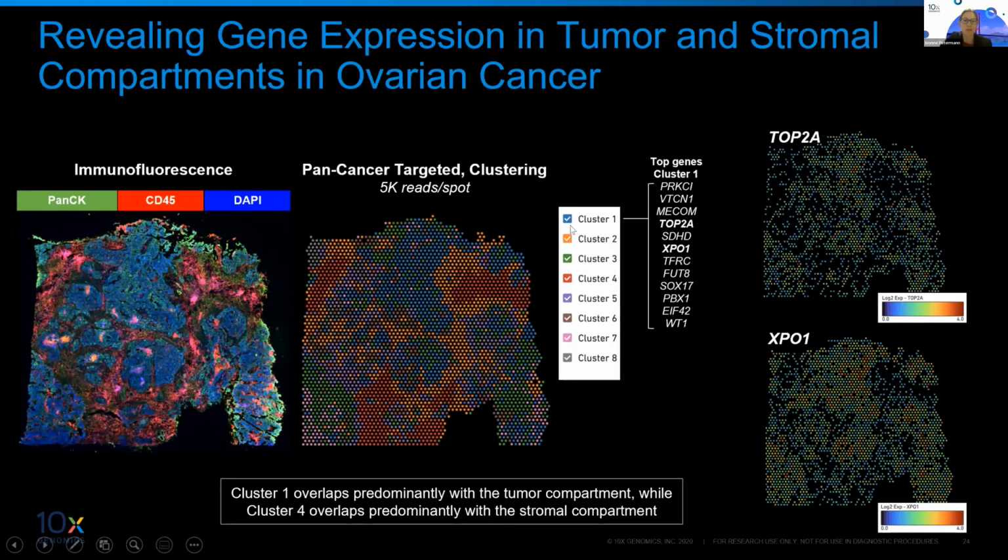So you can look at the different clusters that have been identified based on marker gene expression. And you can now zoom into each and every single cluster that's been identified. For example, if you're looking here at cluster 1, you can now look at the top expressed genes, but you can also look at the least expressed genes, so that's completely up to you.